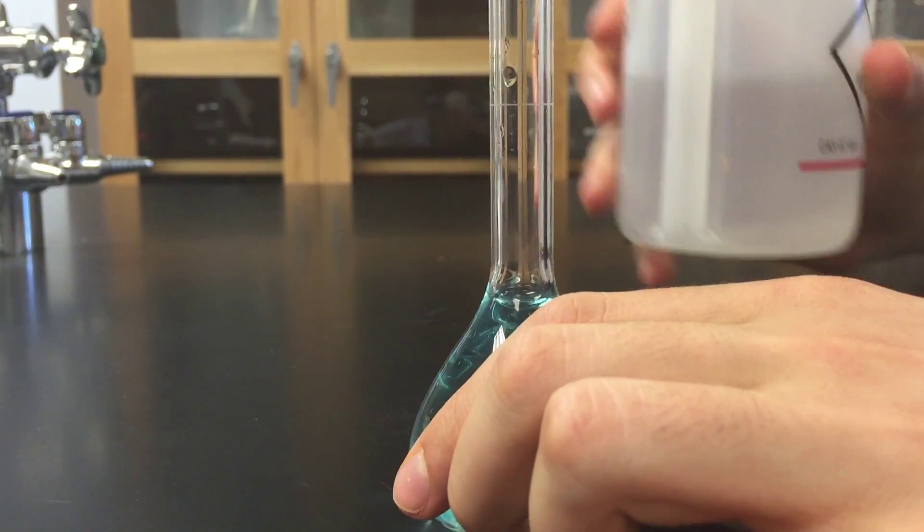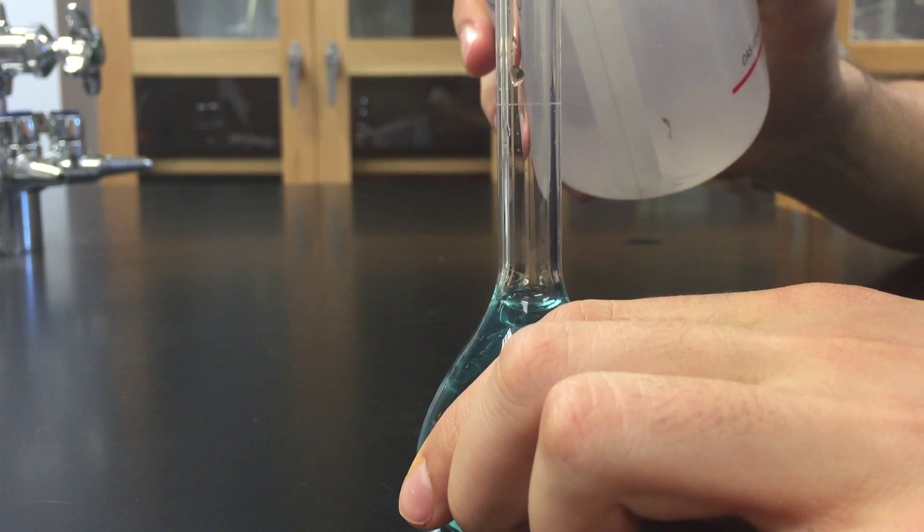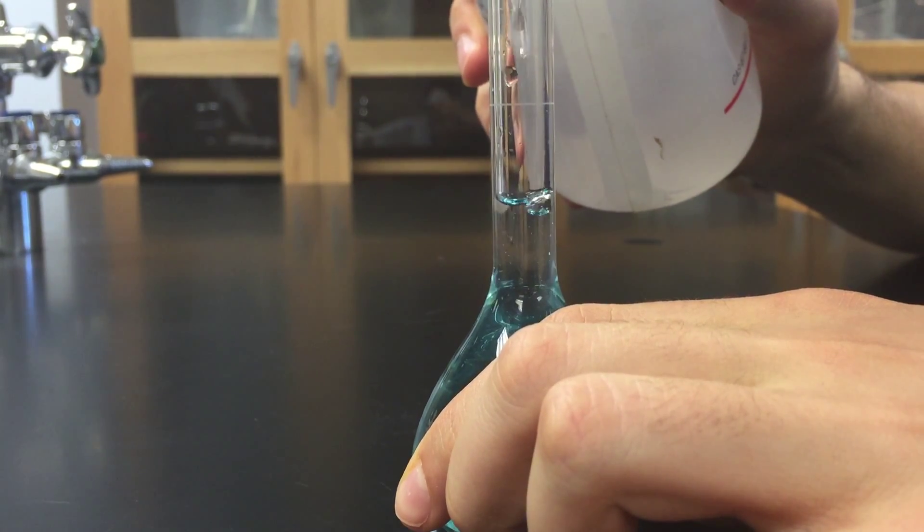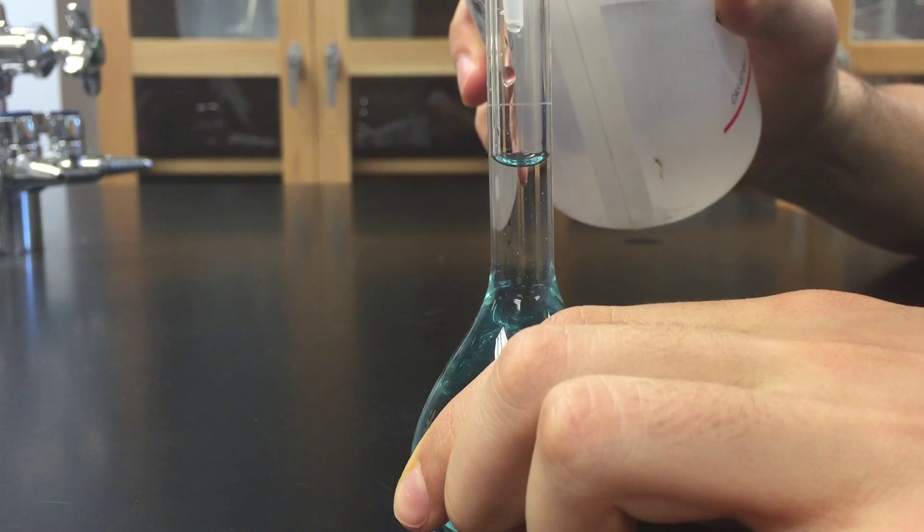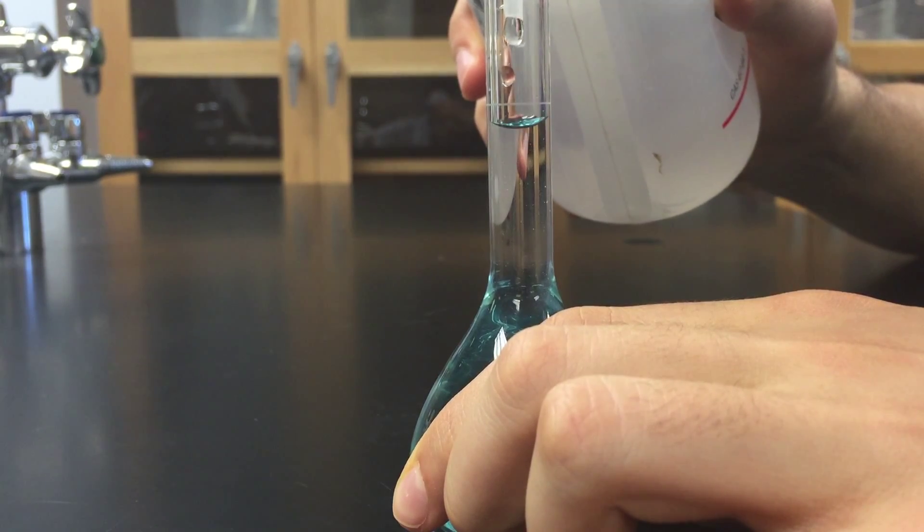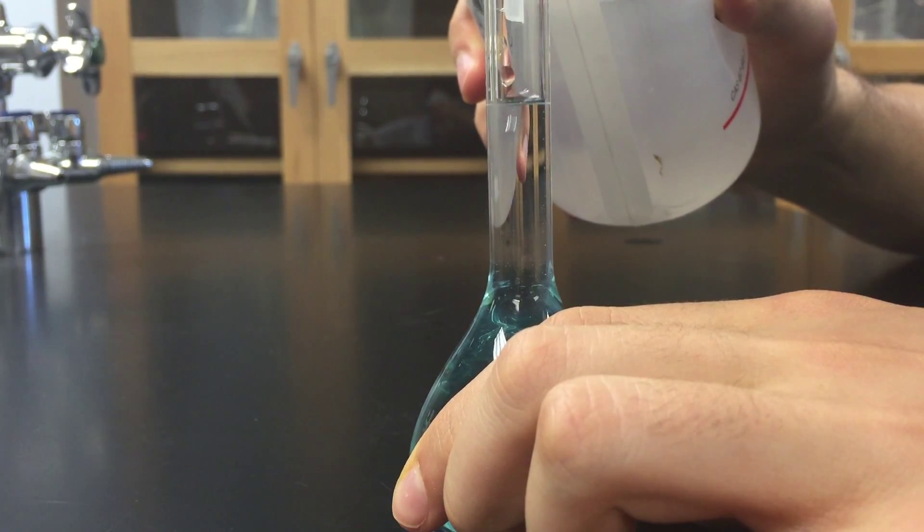The most important part is filling up the volumetric flask to the etched line. This line is very precise, and you want to make sure that the bottom of the meniscus is exactly at the etched line, just as shown.